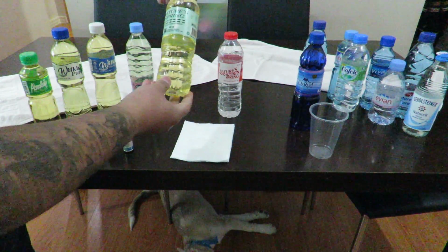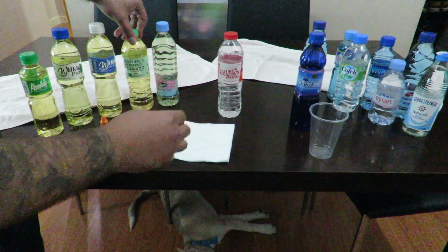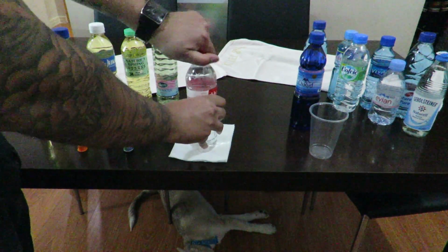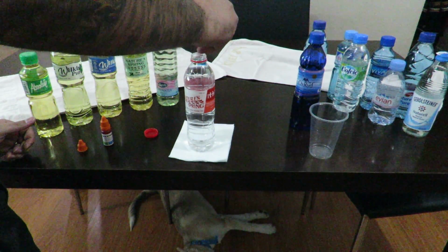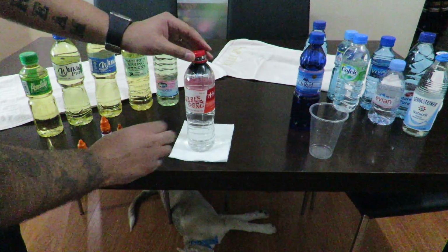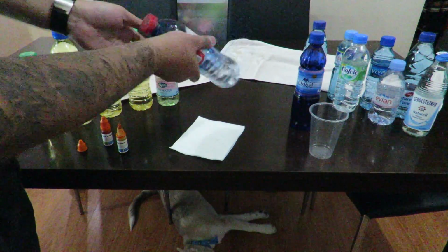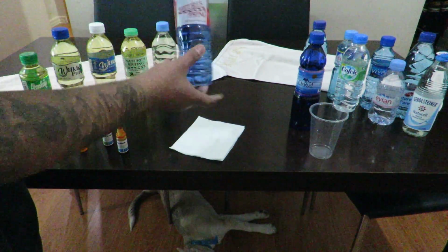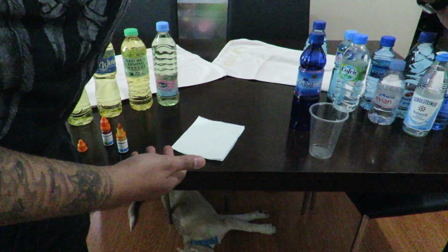So, distilled drinking water turns out to be not the best type of water you want to be drinking for your body. Let's see what the Nature Springs pH 9 says, the red label. I put a lot in just to see the color change. And what do we have? Nature Springs backs up their pH level 9, which is very good water. That's very good water. Put that over here.